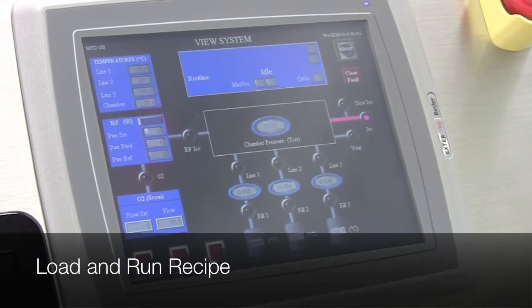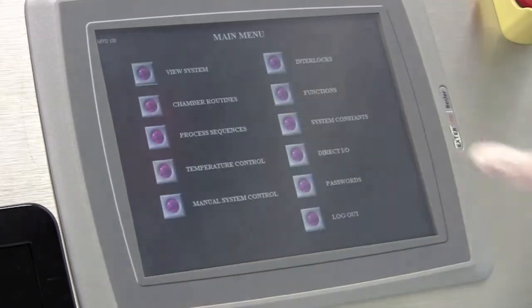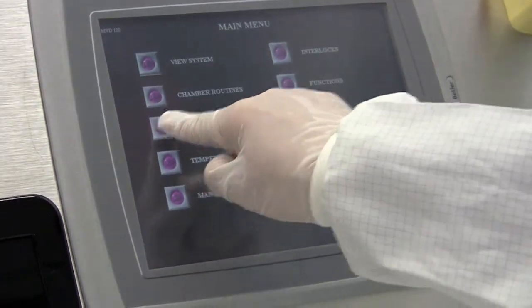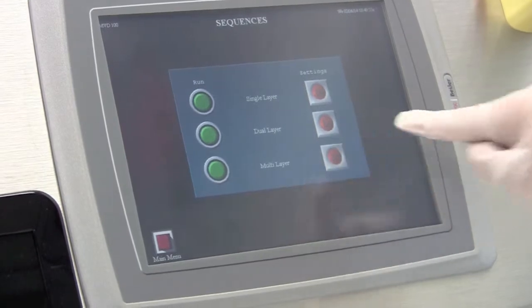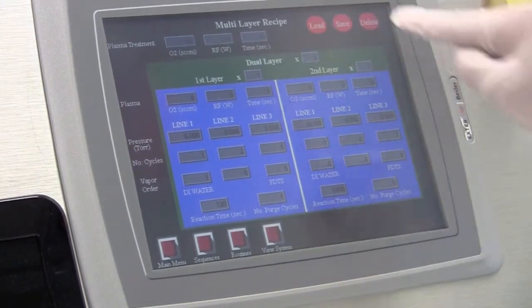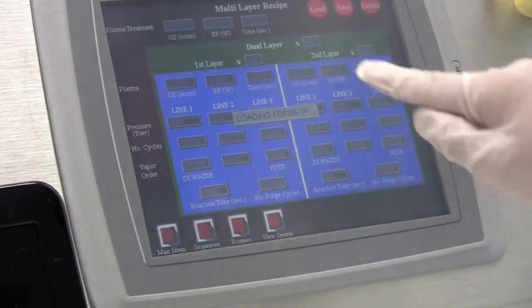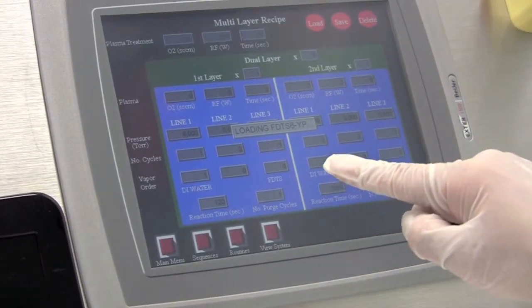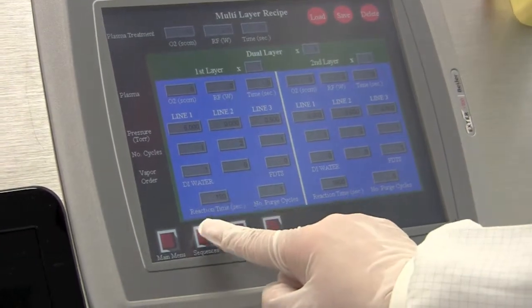So we go to the main menu, touch the process sequences, touch this orange button to load the recipes. Touch load, pick a recipe, and say yes. And then the recipe is loaded. Then we go back to the sequences and push the green button.